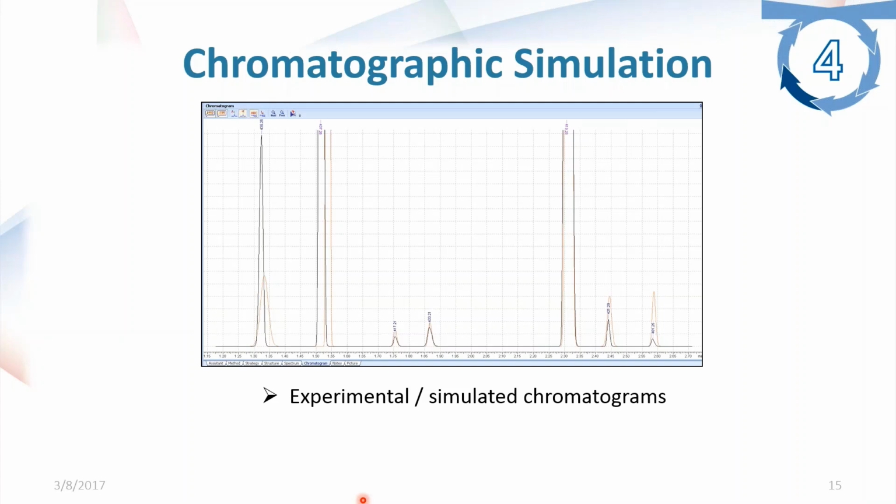If this fits my critical quality attributes, then I could be finished. If in fact the model was different from my experimental results, I can put that additional experiment back into the software and have the model redefined or reconfigured and suggest next experiments based on the refined model.